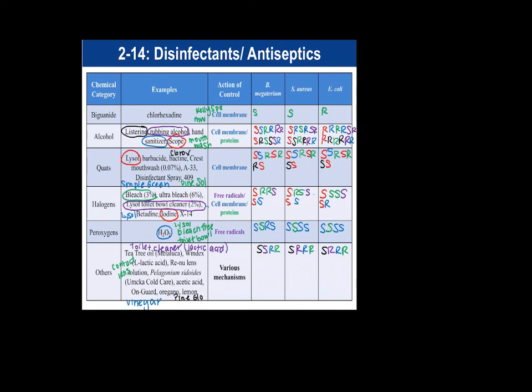If you're using Clorox wipes, it is effective against these bacterial species, but only when you maintain that surface being wet for 4 minutes. So that is a product that you're going to have to continuously keep that surface wet in order for it to work, which may not be how you actually use that actual product in the home.